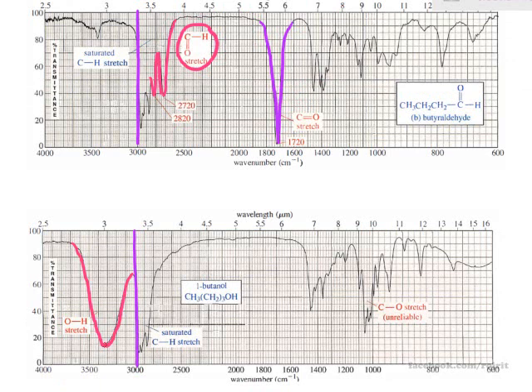The strong absorption indicates the very high polarity of the functionality, and the broad absorption, as I said, is the character of hydrogen bonding, right? So this is the character of OH and NH. OH is highly polar compared with NH, so normally the absorption of OH is stronger than the amine.